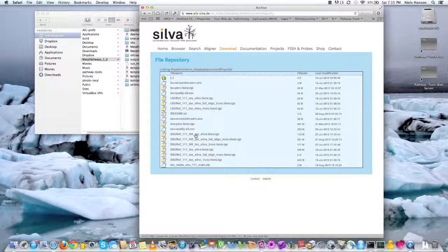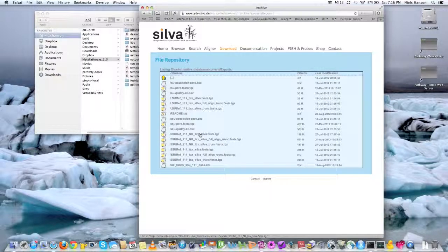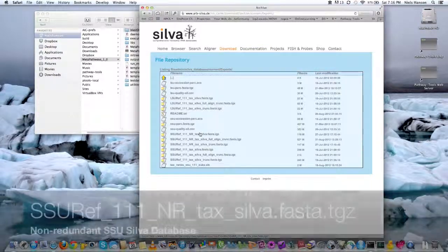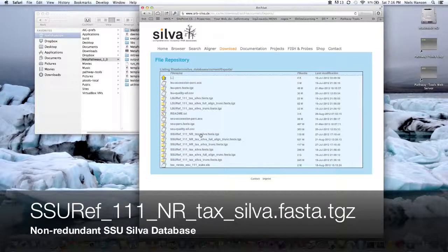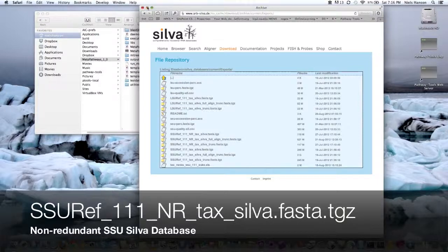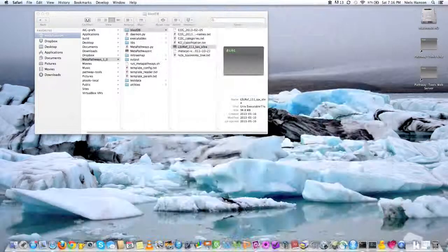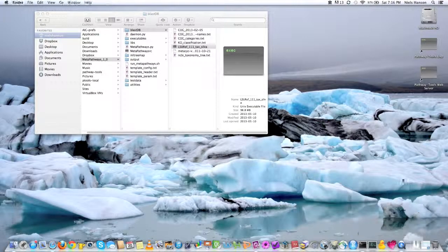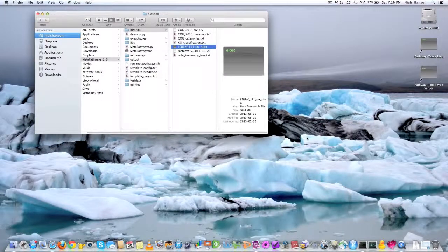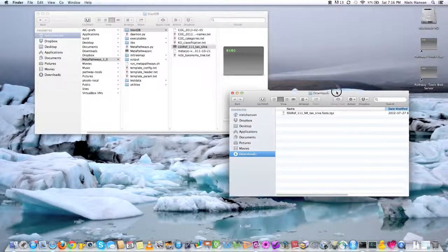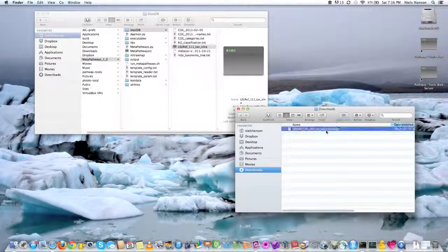That is a FASTA file that has been tarred and gzipped for compression reasons, and that's the one we can download. So you click there, and you can download it. So I've actually already downloaded it right here, and once you get it, you need to extract it.